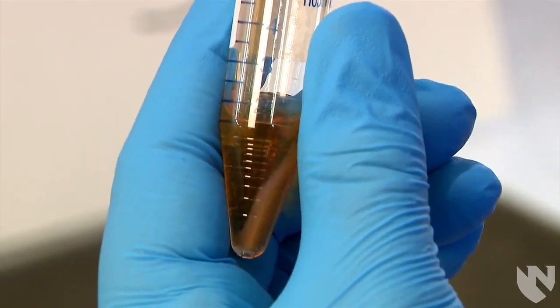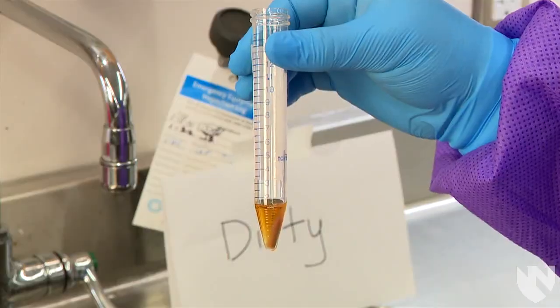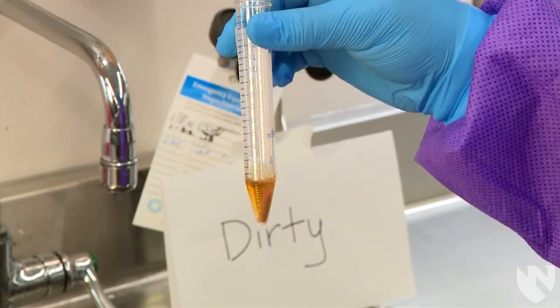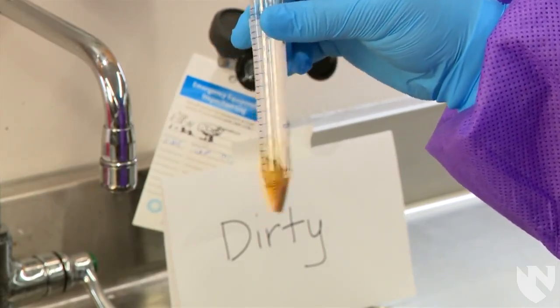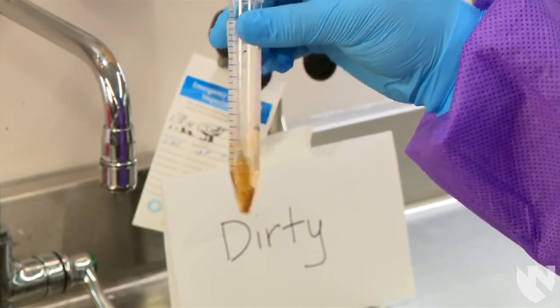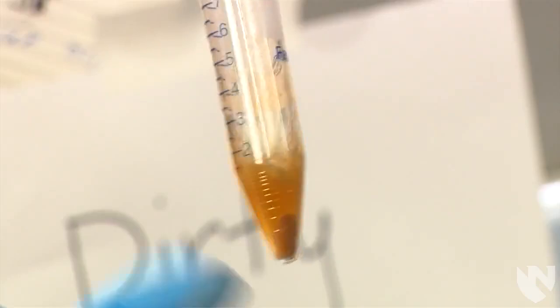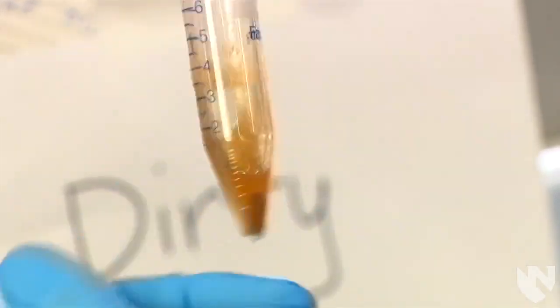We can re-suspend the urine sediment in two different ways. The first way is by holding the top of the conical tube and gently shaking the bottom until the pellet is gone. You can also use the index finger of the other hand and flick the bottom of the conical tube.